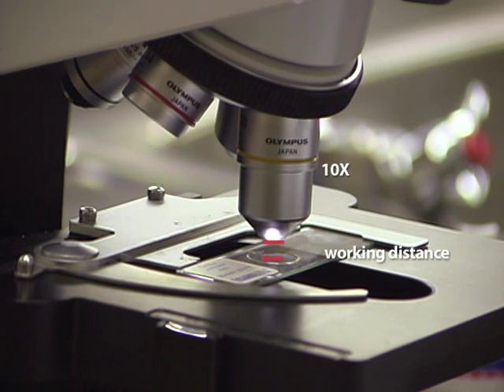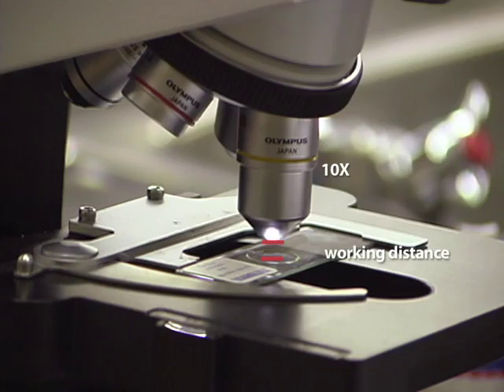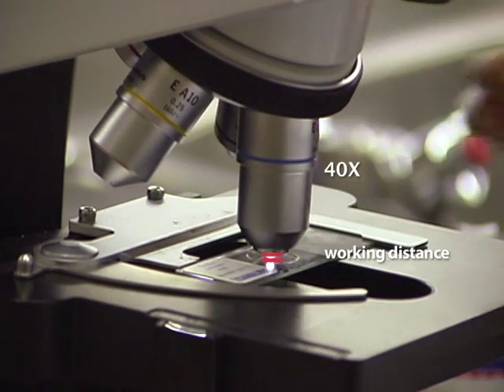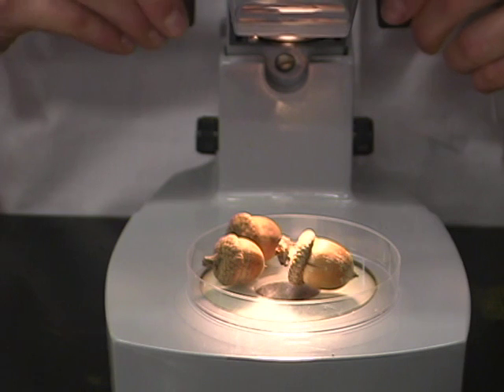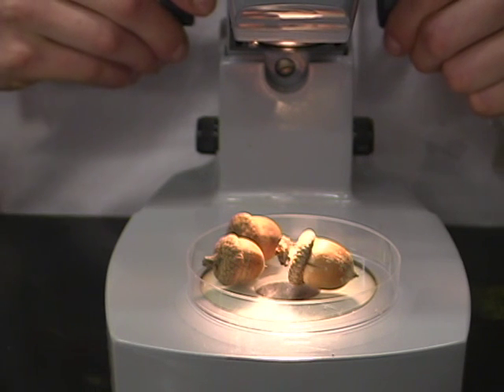This causes the working distance, the space between the object and the objective lens, to decrease. In stereo microscopes, the working distance is very large, several centimeters.